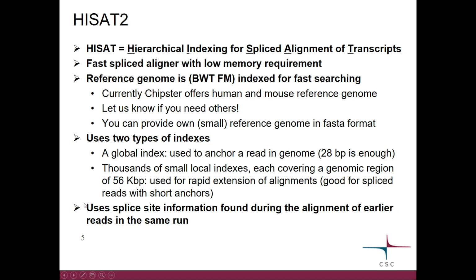The other smart thing that HISAT is able to do is that as it's running, it encounters splice sites, it keeps those in mind. So when it takes the next read to align, it can use the information it collected from the previous reads. Again, this is good for those splice reads with very short overhangs.